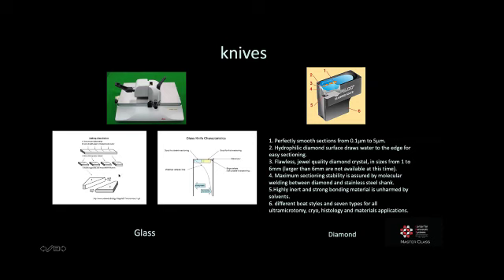We're going to then break that perfect square on the diagonal so that we have hopefully two 45-degree knives. While that's not likely to happen, what we generally end up with is knives that have a knife on one edge and a flat edge on the other. This means that this break did not happen at the 45 degree, but slightly off. We call this edge the knife, we call this edge the foot, and we're going to judge the quality and sharpness of this knife by the size of this foot.